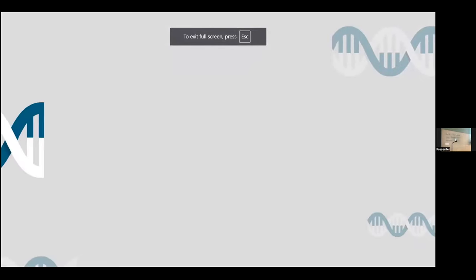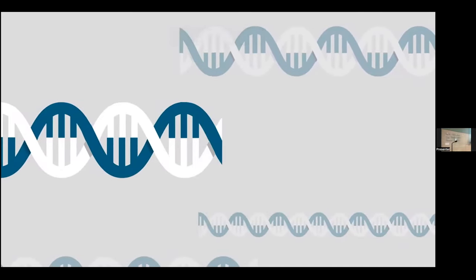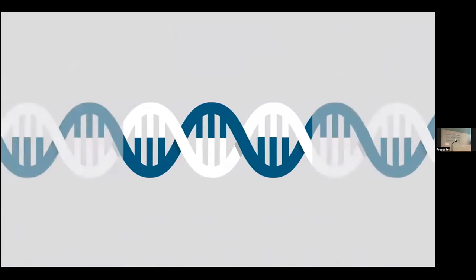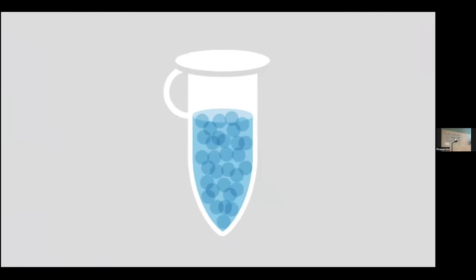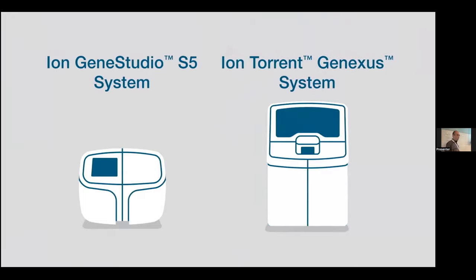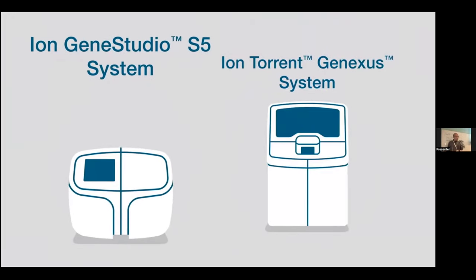Next generation sequencing is a powerful technology which can interrogate many targets at the same time, from just a few genes to all of the individual nucleotides and more. Next generation sequencing is making it faster and faster.